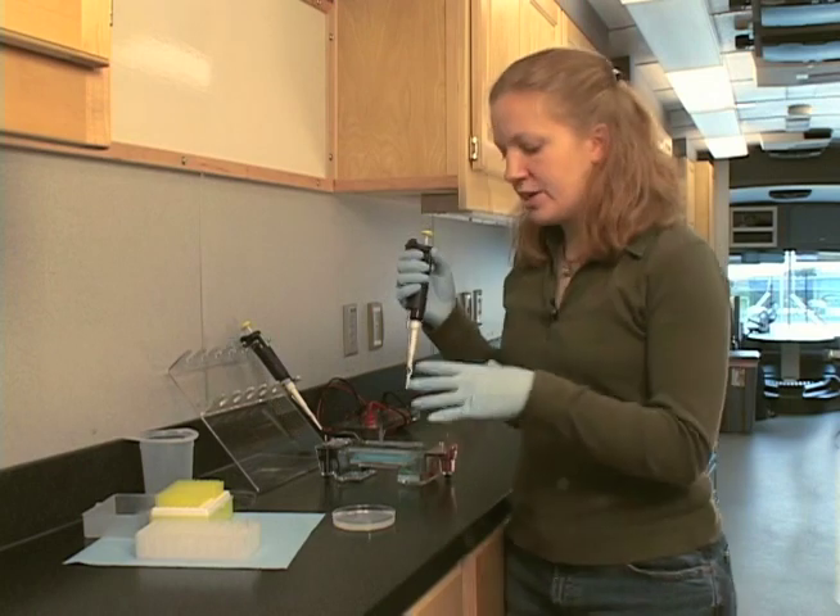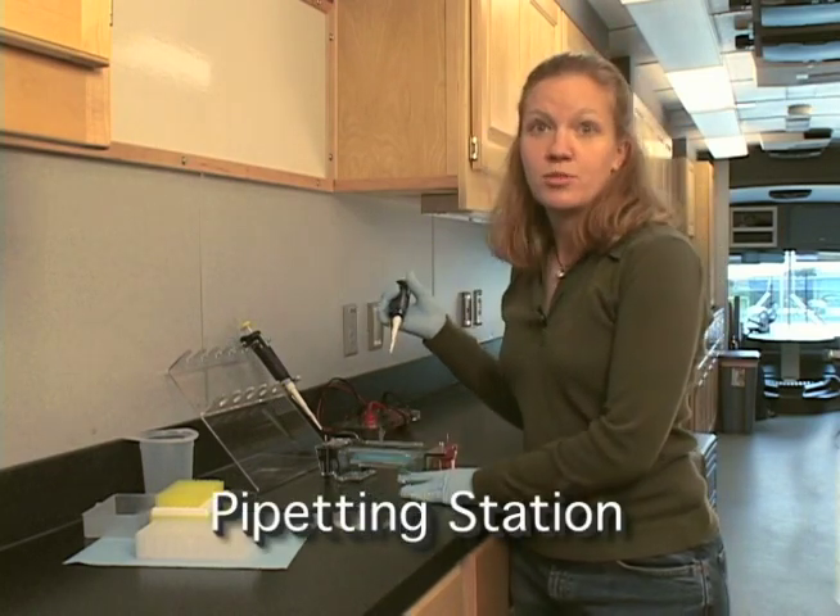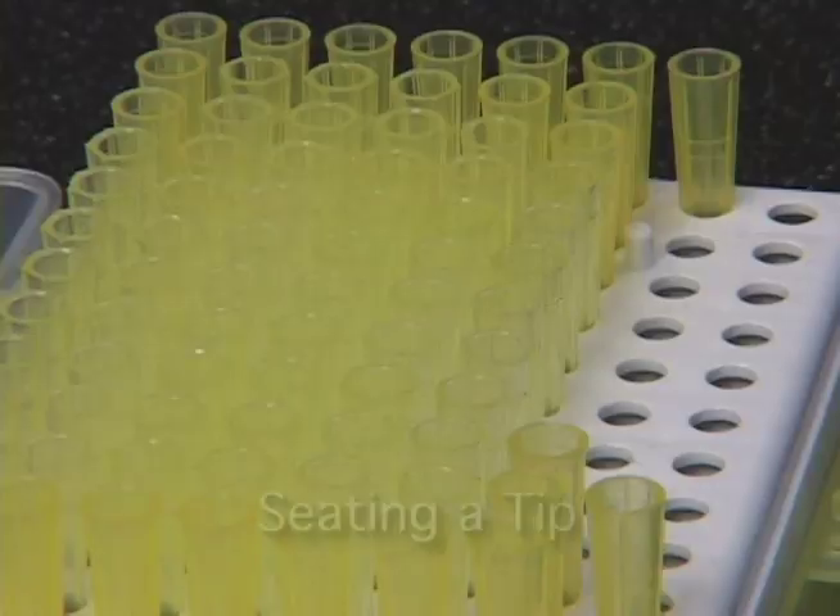Today, I'm going to show you how to do something that I do a lot when I'm working with DNA, which is load a sample onto a gel, and then you can use the gel for electrophoresis. What we're going to do is practice on a pipetting station once, and then we'll load a sample onto a gel in a gel box for electrophoresis.